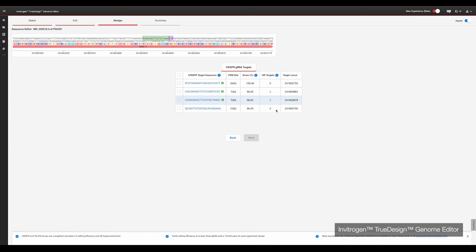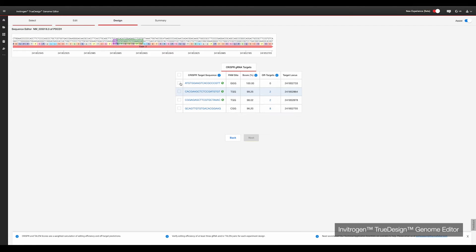However, just because an off-target is listed, it does not guarantee this edit will occur, especially if your gRNA has a high performance score. Overall, a gRNA with a high score and a low off-target number is ideal. TrueDesign will add green checkmarks to the top gRNAs it has identified. We recommend trying two or three gRNAs for each gene target you are editing. Clicking on each gRNA will show you where it lines up with the site of interest, with the PAM site highlighted in the purple box. Simply select the gRNAs you wish to use via the checkboxes.